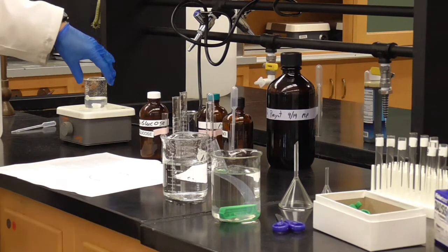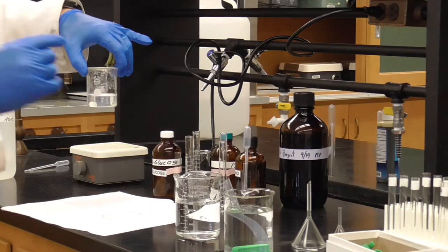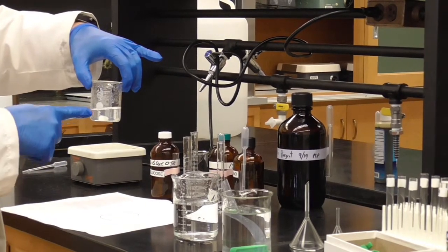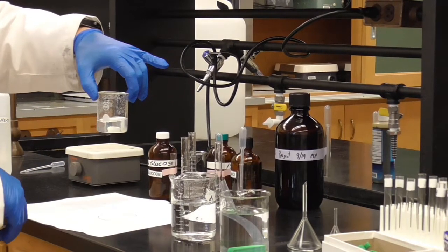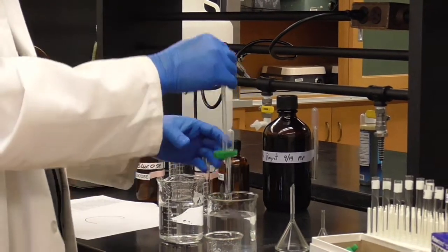And of course, our solution is over here, the one that we just mixed together, right? With 3 different solutions. This has got chloride in it, it's got glucose in it, it has starch in it. We mixed it all together. So we're going to pour this inside of the tubing. Now, of course, how do you get it in there?